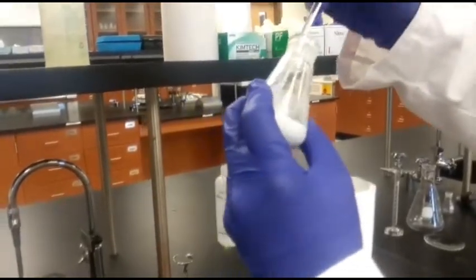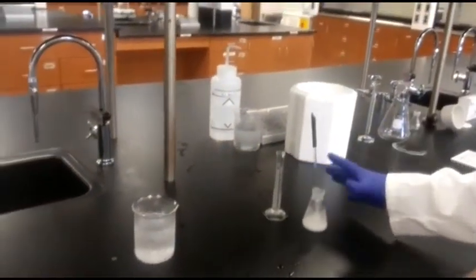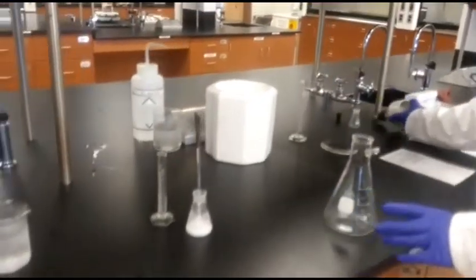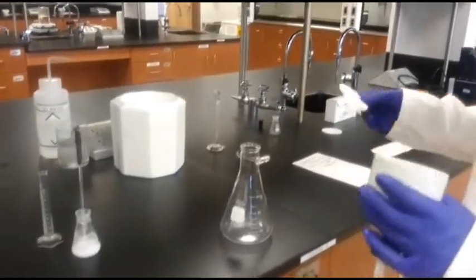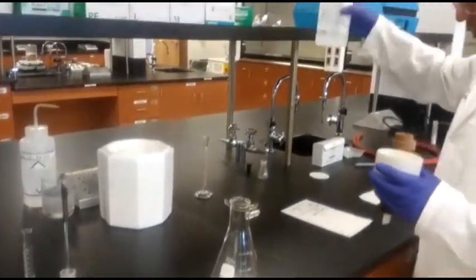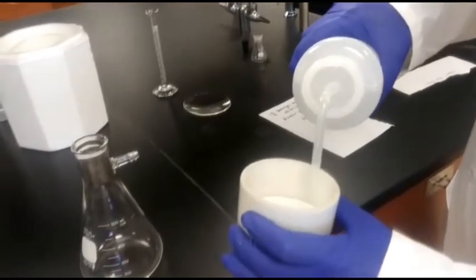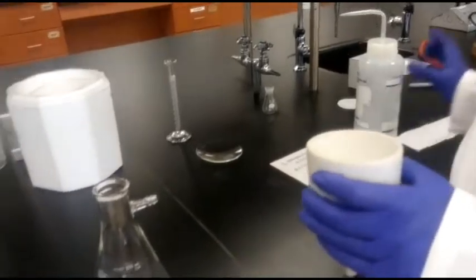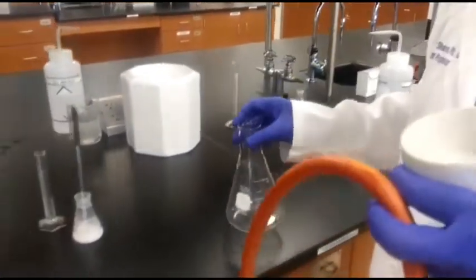Now we need to separate this product by doing the filtration. You are all familiar with the vacuum filtration using the Buchner flask. So I use this small filter paper and make it wet by using some distilled water. Let it stick here on the surface, and I will use this hose so that I can secure that here.